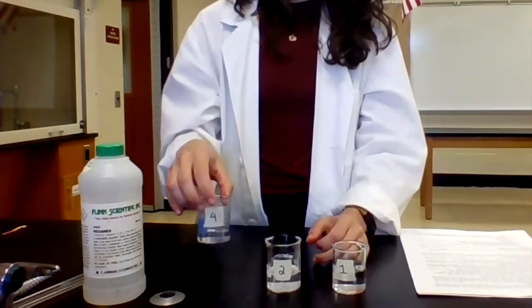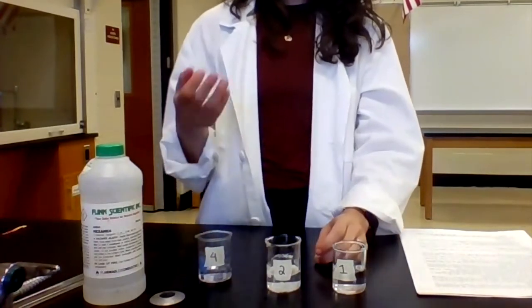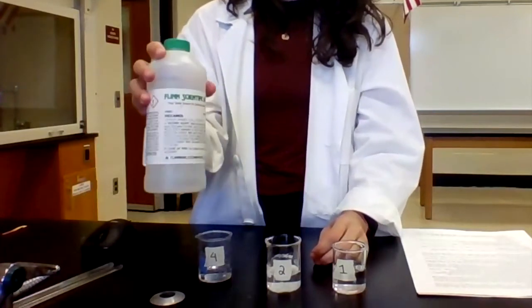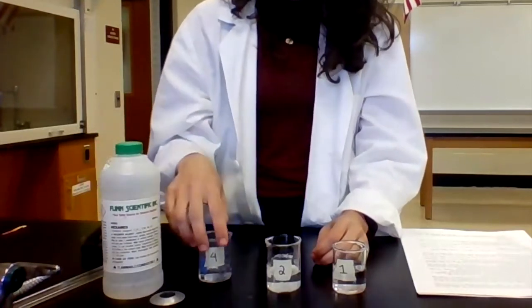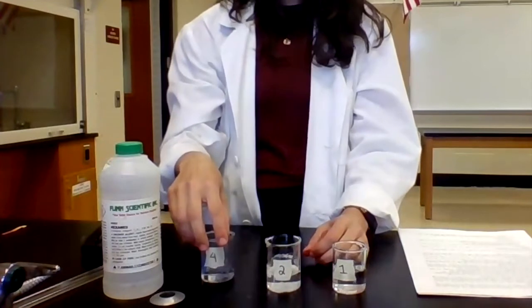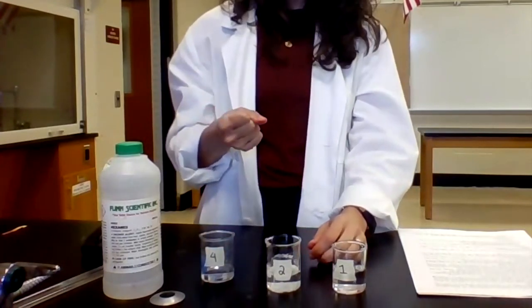Now, solid 4, remember we classified solid 4 as likely non-polar covalent due to its low melting point. So in order to confirm that, I added hexanes to the beaker as opposed to water. And what we can see is that solid 4 did dissolve in the hexane. So this was a good confirmation to say that solid 4 is likely non-polar covalent.